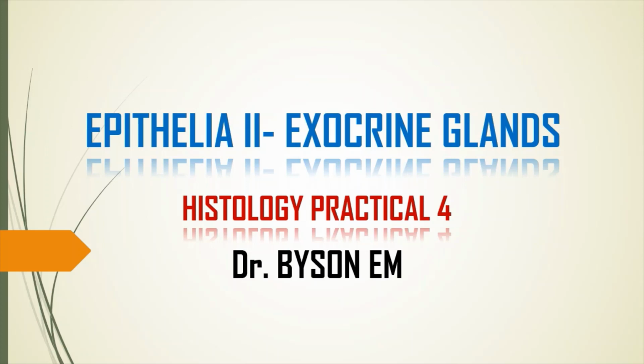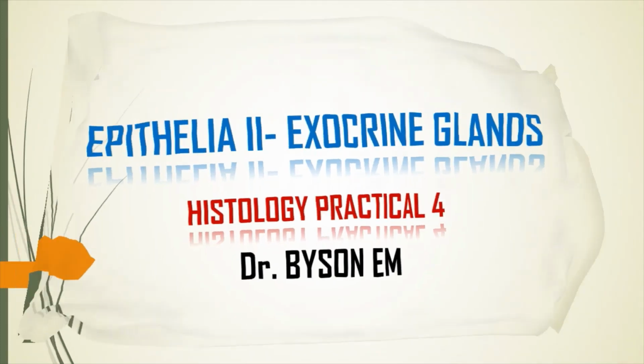Today we're looking at epithelial 2, exocrine glands. This is histology practical number 4. Without wasting much time, let's look at what we are doing today.